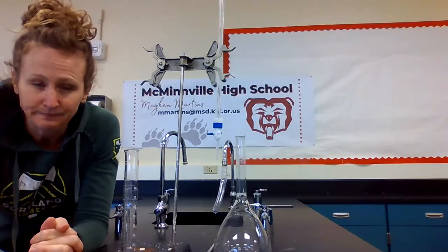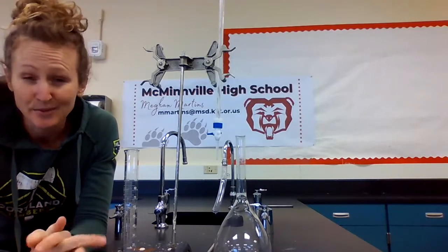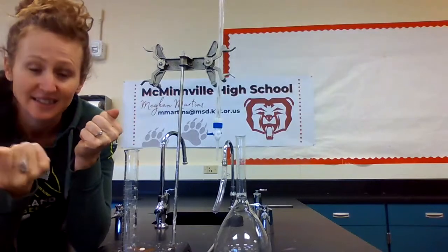You may have also thought of the ion doesn't absorb light. So if you think back to when we analyzed copper nitrate with the spectrophotometer, right? We put into our solution copper and nitrate. Right? But our spectrophotometer only picked up copper.